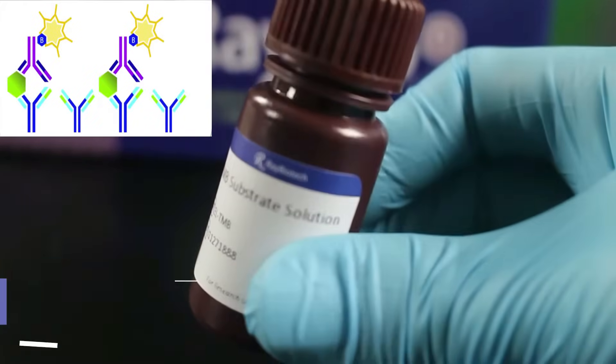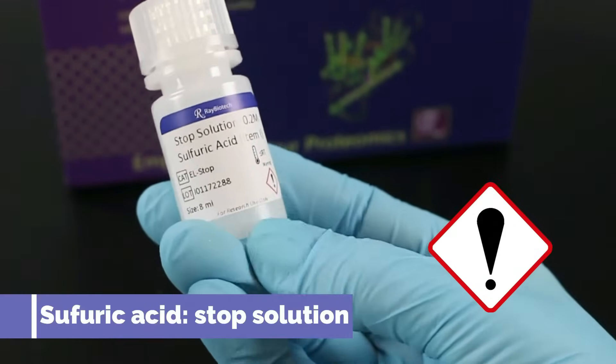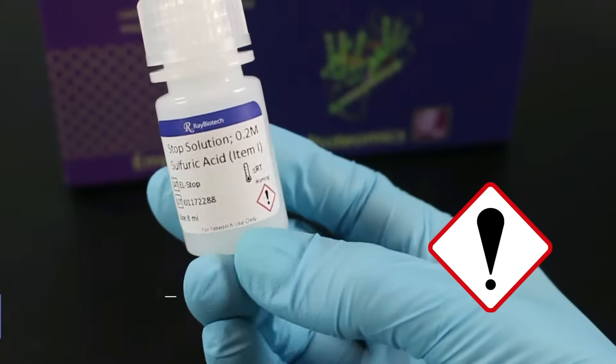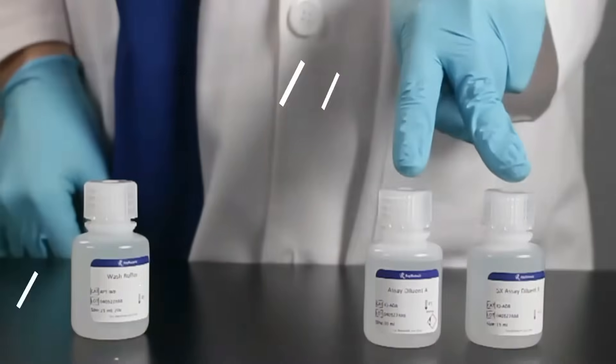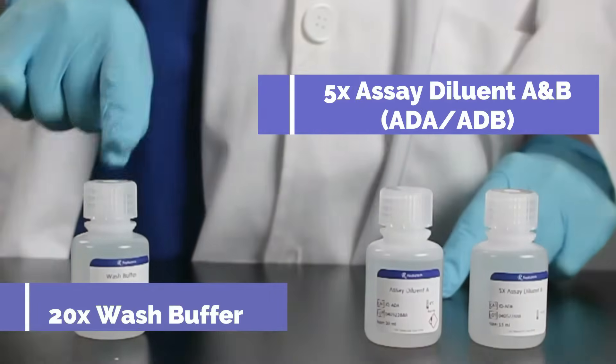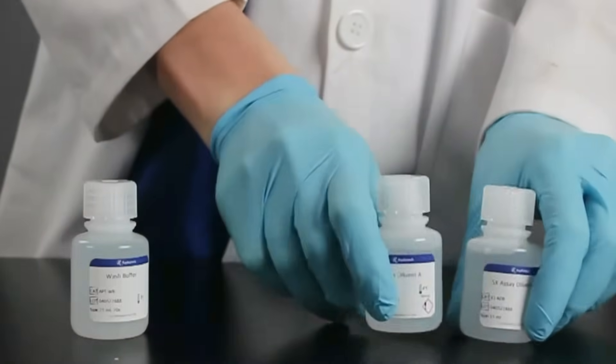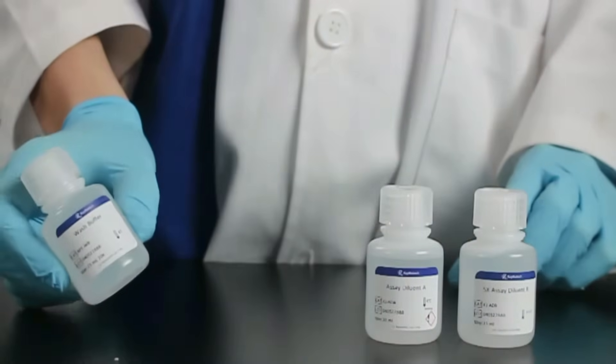That reaction is stopped with dilute sulfuric acid or stop solution. You have two concentrated assay diluents and one concentrated wash buffer. ADA is only used with cell culture samples. We recommend using our wash buffer even if you already have one of your own. Plate seals are used for each incubation.